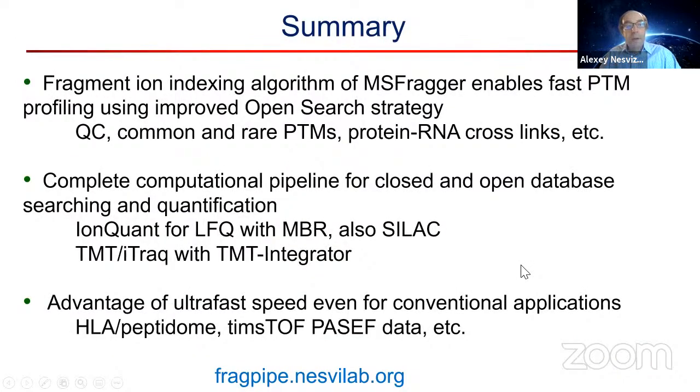So in summary, I told you about the open search strategy in FragPipe for PTM analysis, the quantitative workflows, and also mentioned that we have a lot of advantages for standard workflows and other things such as HLA peptidome analysis and so on and so forth.